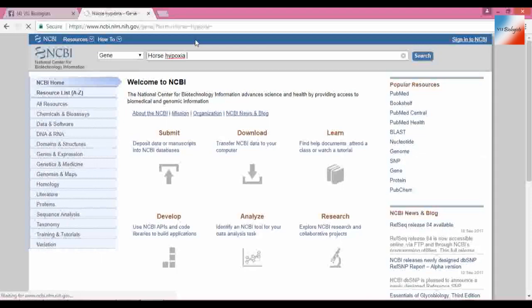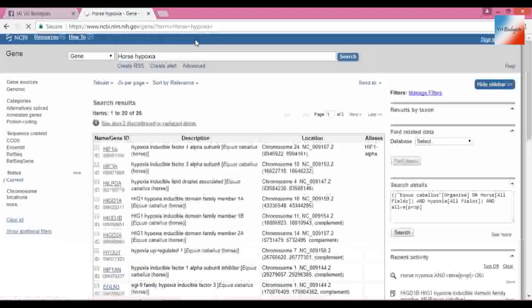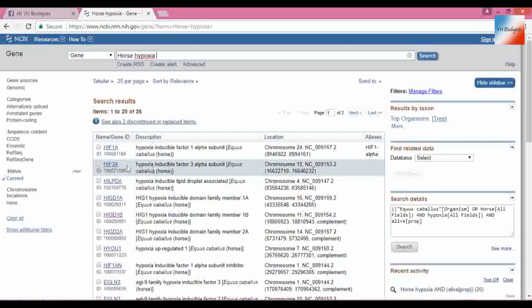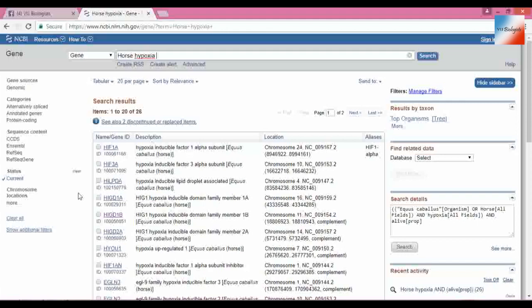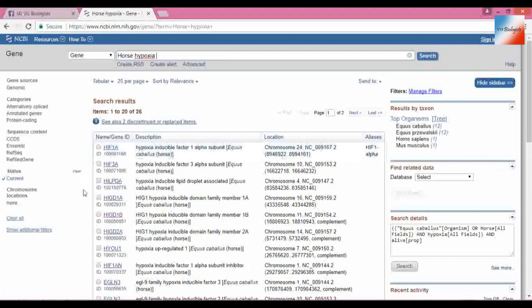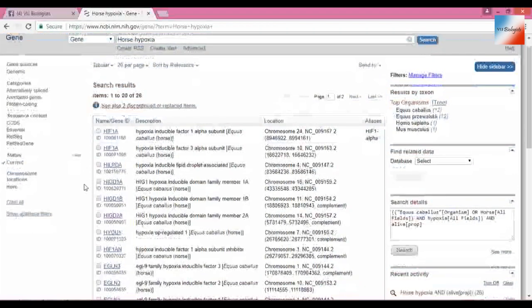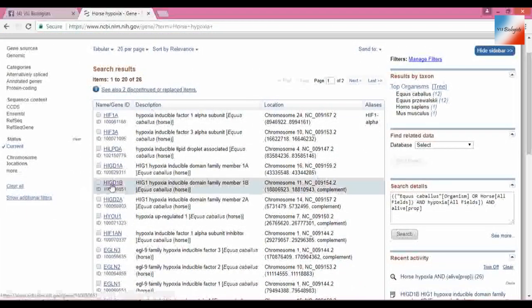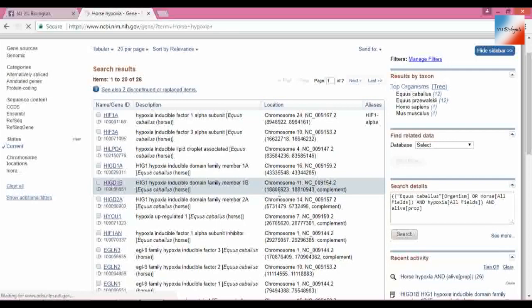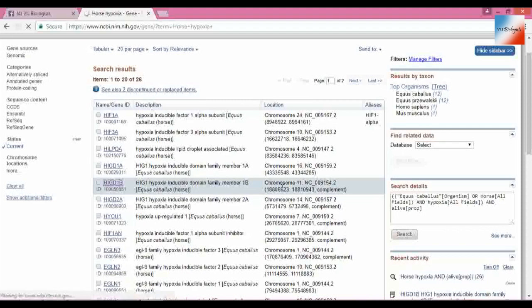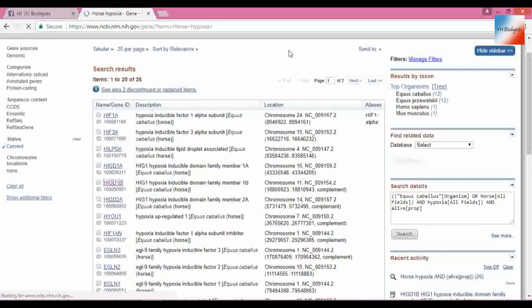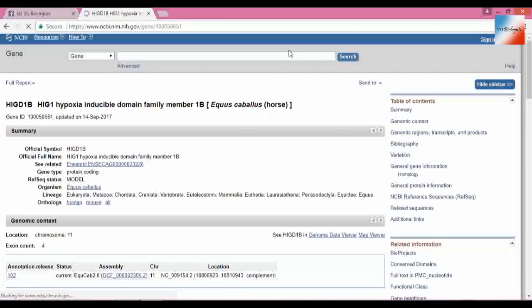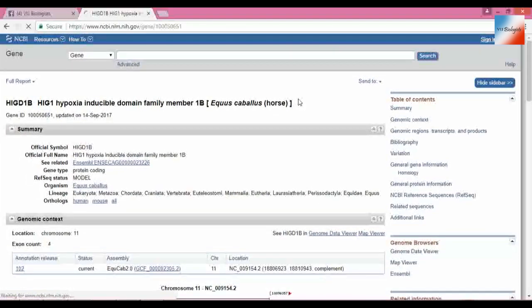Preferably we should use the scientific name of horse, but that's okay. So here are the genes that people have selected and submitted to the NCBI website. I'm looking for that gene, it's on chromosome 11. It gives our data, but we are looking for sequence. So here is NCBI.